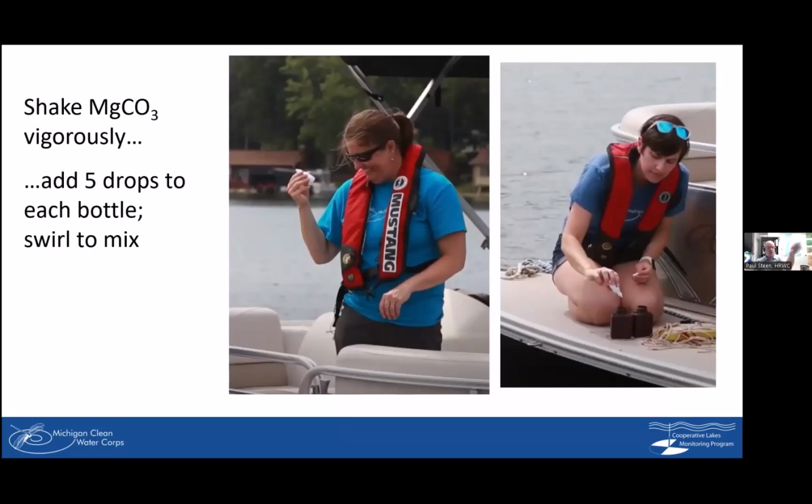So you do shake that up crazy, and then in each of these smaller amber bottles, you put 5 drops. And what that does is it helps stabilize your algae cells, just prevents some degradation, and makes them hold up a little bit better through the next steps.